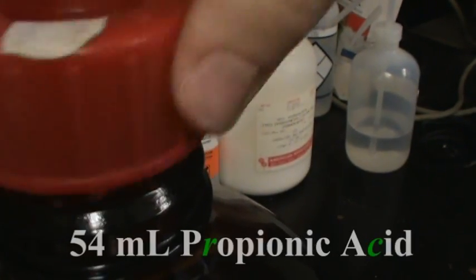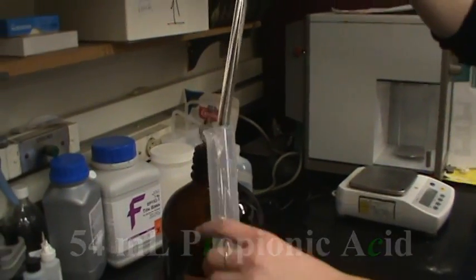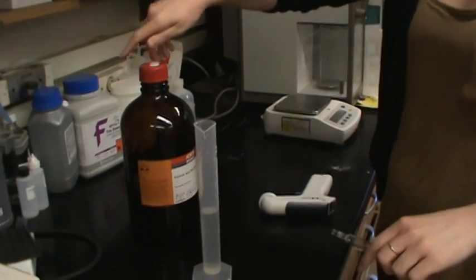Another precaution against mold is propionic acid. We will be adding 54 milliliters. Now that the food is cooled to below 70 degrees, we will add the propionic acid.